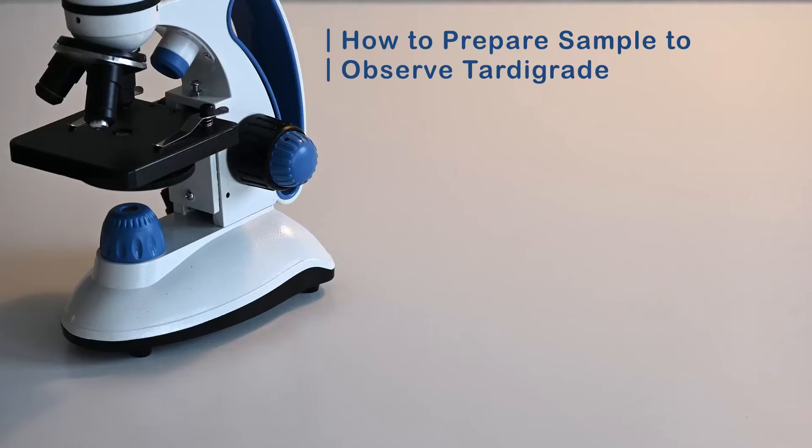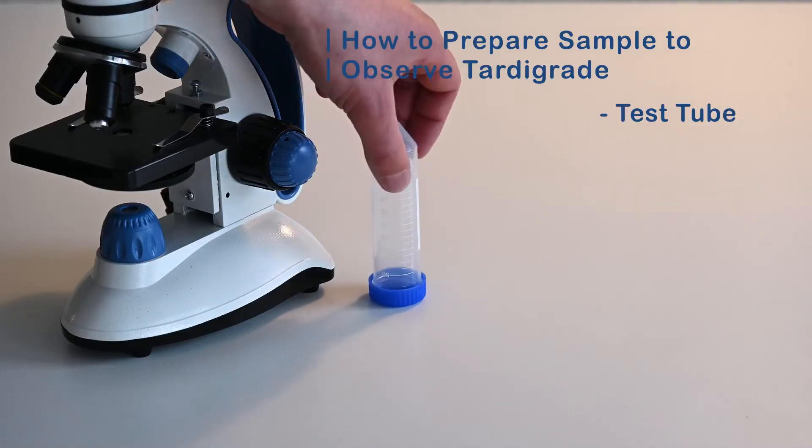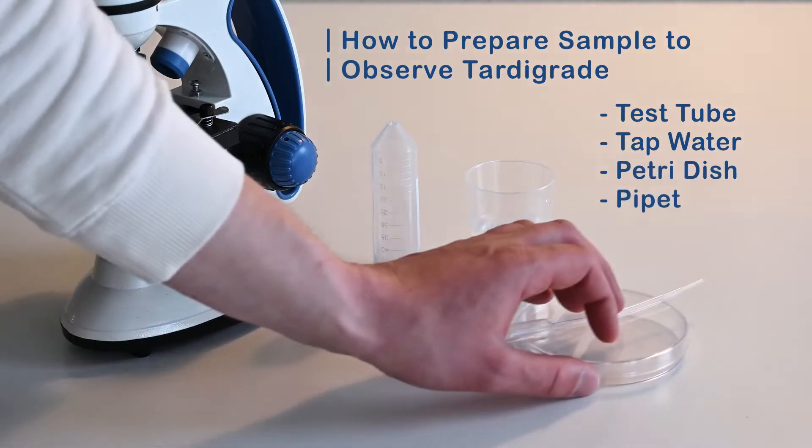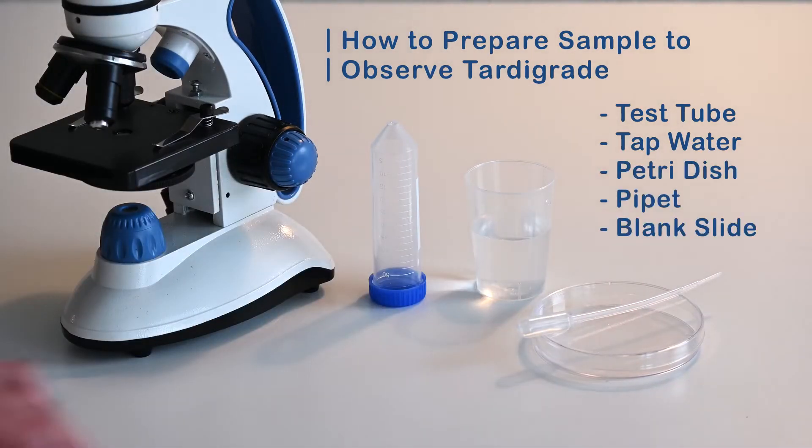The things we will be using are a small container to hold a sample — I'm using a test tube, but a small jar or Tupperware will work just as well. We will also need some tap water, the petri dish and pipette from the lab kit, and a blank slide and cover slip, which also comes with the microscope.